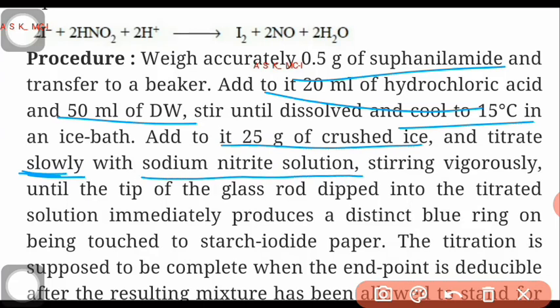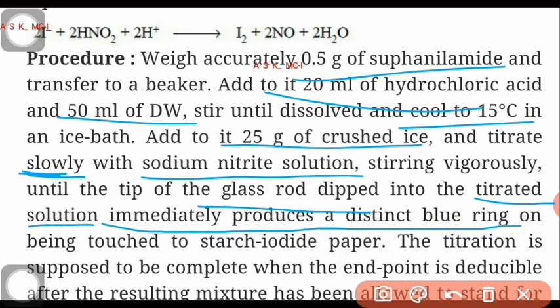Take a glass rod, dip it into the titrated solution and place it on the starch iodide paper. It immediately produces distinct blue color, and that is the end point.